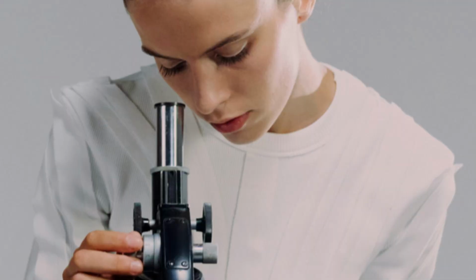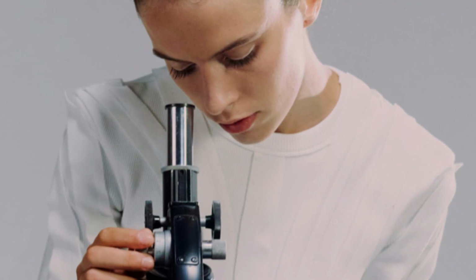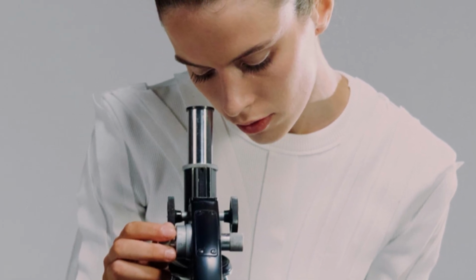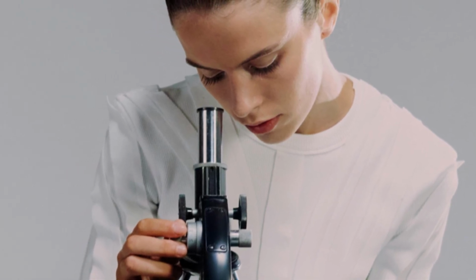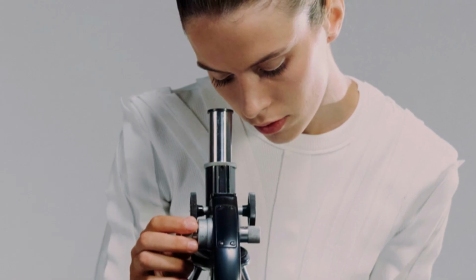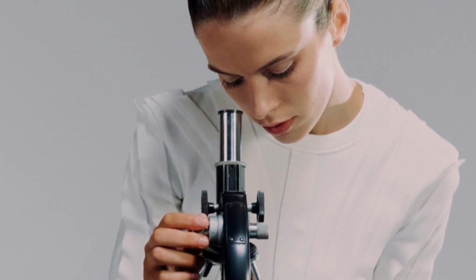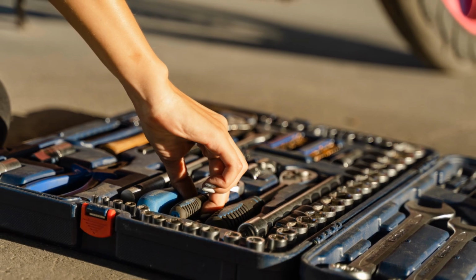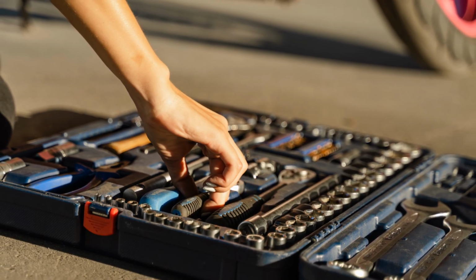Section 7. The right tool for the job. Making the choice. So, after this journey into the world of the very small, we come back to our original question: which microscope should you use? The answer is simple. It all depends on what you want to see. There is no single best microscope. There is only the best microscope for a specific task.